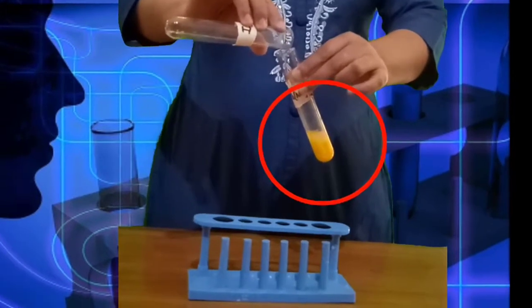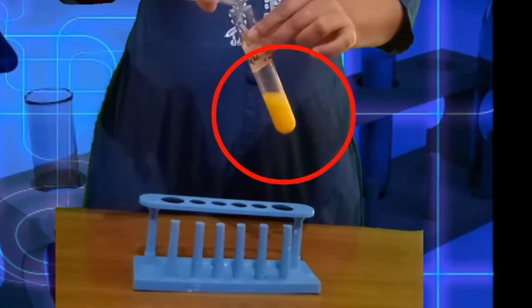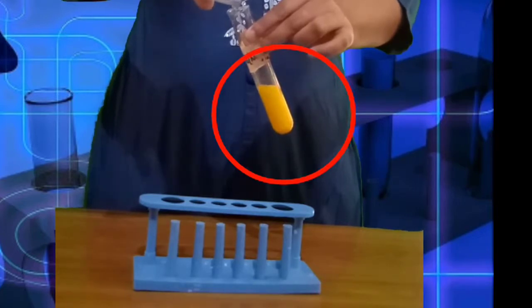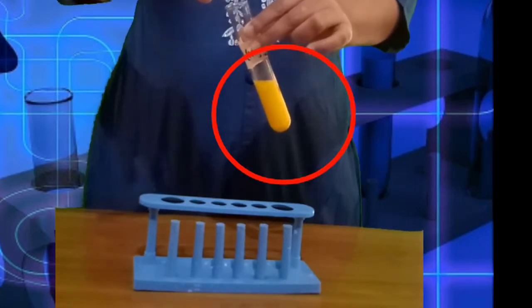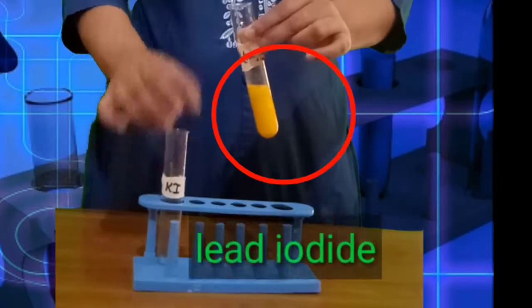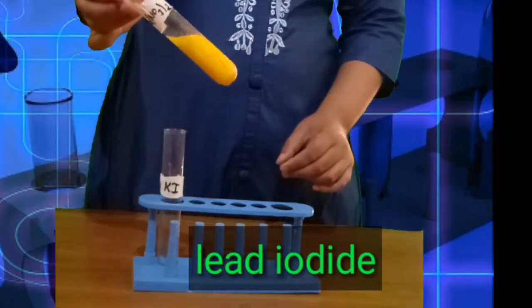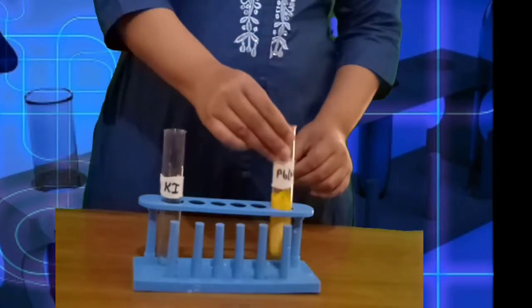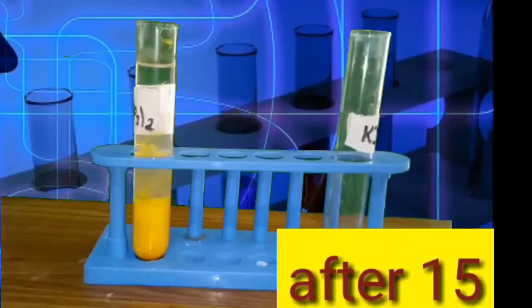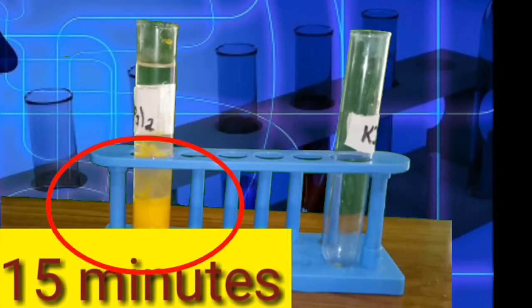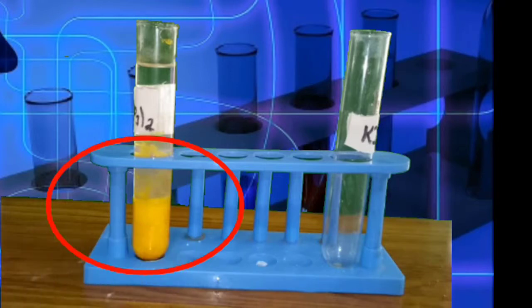You will observe that dark yellow color will appear here, and this yellow compound is lead iodide. Put the test tube for 15 minutes, and after 15 minutes you will see that yellow compound gets settled down and these are precipitate, that is an insoluble compound.